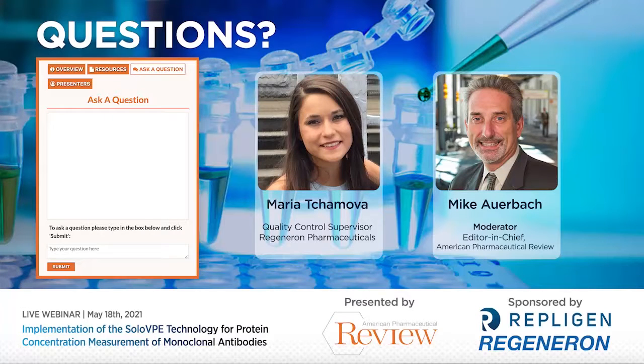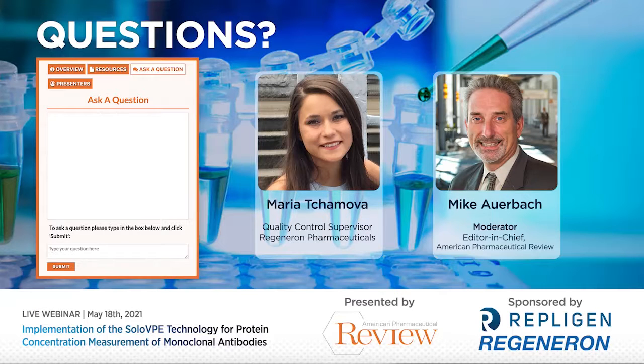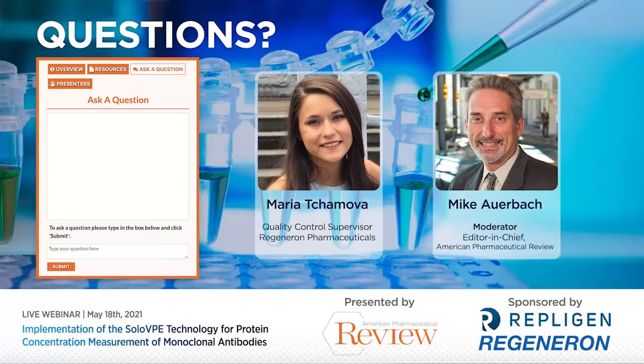How long does it usually take for the SoloVPE system to be installed and validated for QC work? That really depends on the company's procedures and their available resources. Typically, at least for first-time implementation of the technology in the QC lab, it could take up to a year. That includes acquiring the instrument, setting it up, qualifying it, setting written procedures in place to guide the operators, and then also validating the methods and training the operators. So any amount of time up to a year.